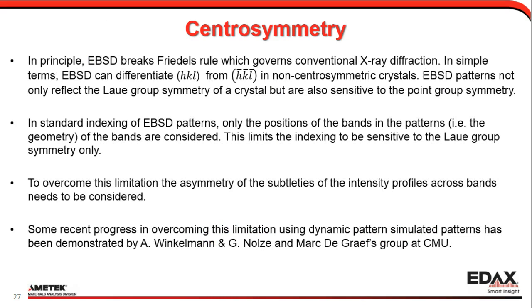And what that means is that in non-centrosymmetric crystals, we can differentiate one plane from its negative plane, so an HKL from an H bar, K bar, L bar plane. So the EBSD patterns not only reflect the Laue group symmetry, but also are sensitive to point group.